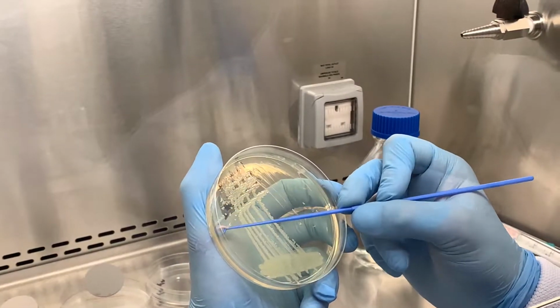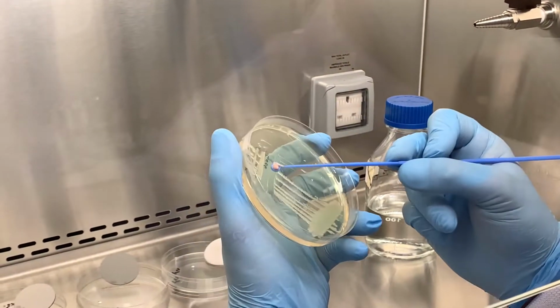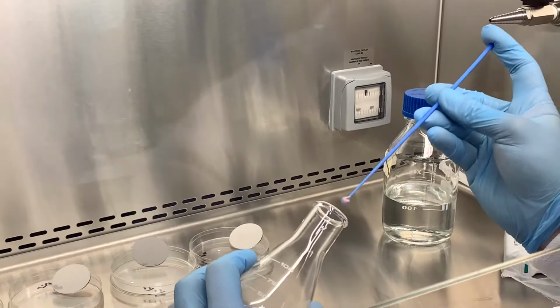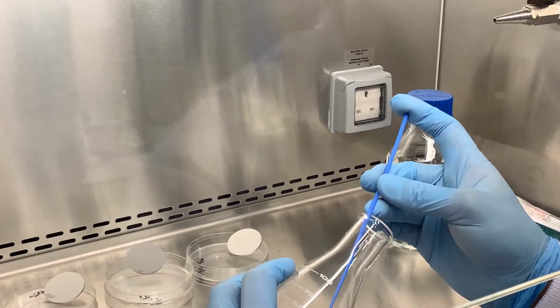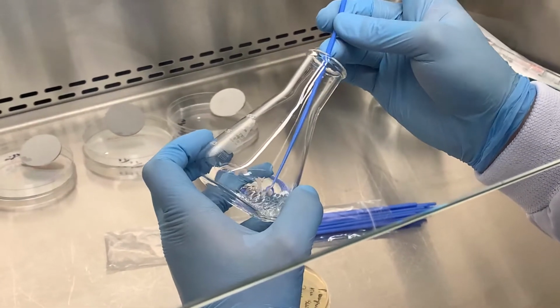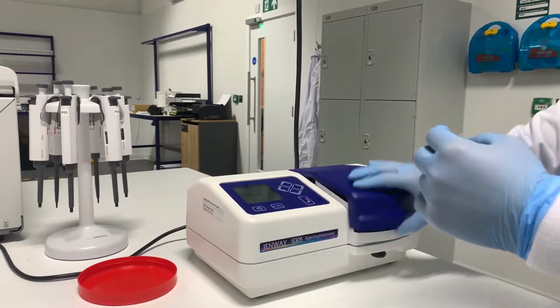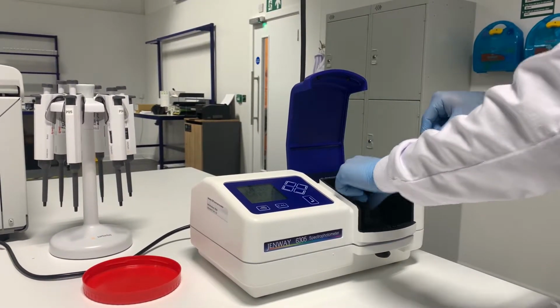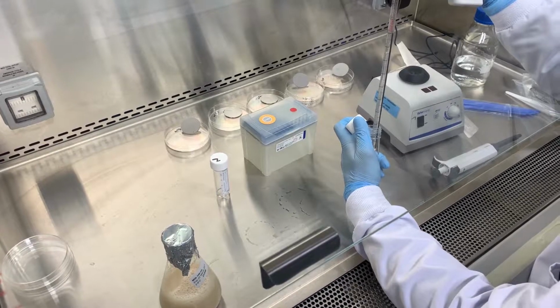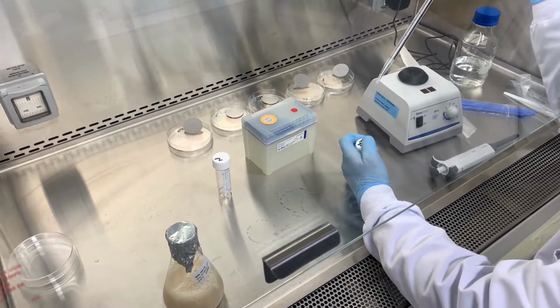At this point, a suspension of the microorganism is prepared. This is performed by harvesting surface culture using a sterile loop. Loopfuls of the cells are dislodged on the side of a 100 ml flask containing 10 ml of sterile diluent. The flask is then shaken for 3 minutes and the suspension standardized to achieve the required concentration using a spectrophotometer. The suspension is then mixed with the interfering substance prepared previously to create a final inoculum suspension ready to be inoculated onto the surface of our carriers.